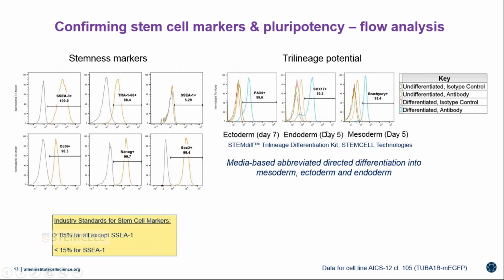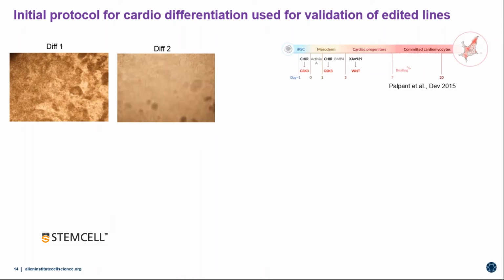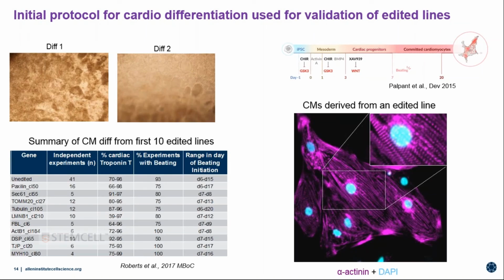So as I mentioned to you right at the beginning, what we really want to do is not just study how these organelles behave in the stem cells, but how they change as the cells become cardiomyocytes. So we've started now developing protocols in-house to differentiate these tagged iPSC lines into cardiomyocytes, and that's looking really good. These are just to show you 2 examples of our beating cardiomyocytes. On the left, the cells are beating, but they're more twitching, and the other cells are beating really hard. So there's a very diverse phenotype, so that is expected, and the protocol we are using is on the right. So we've done this now many times for our edited structures, and it's pretty consistent. And again, that's in our paper, and we are getting to see the beautiful morphology and the organization of some of these cardio-specific structures in these cells as well.